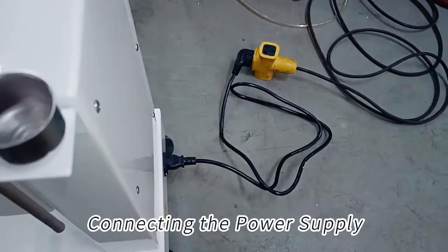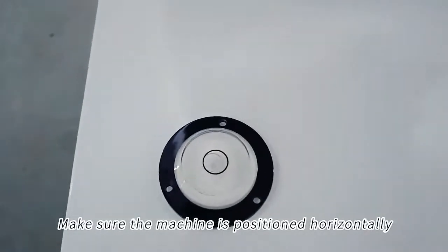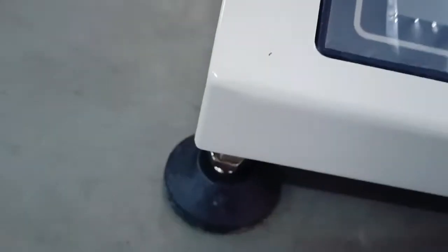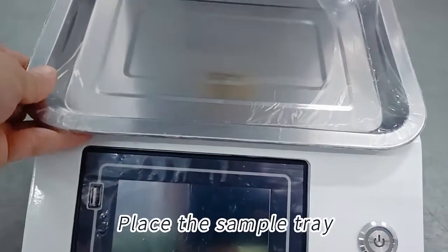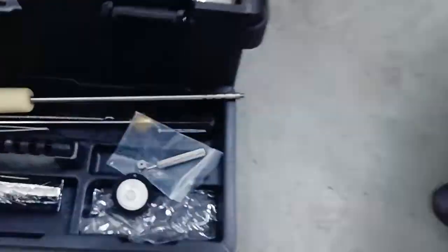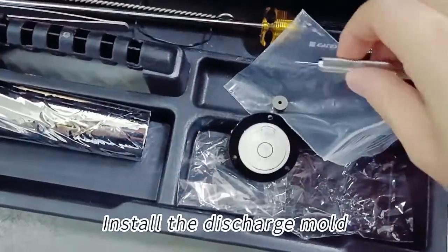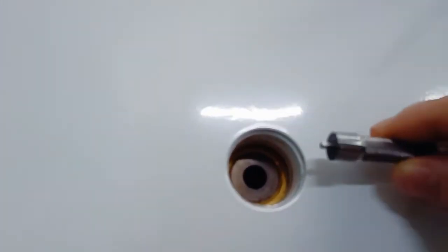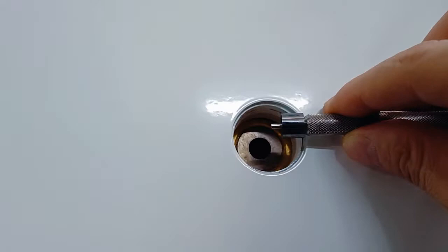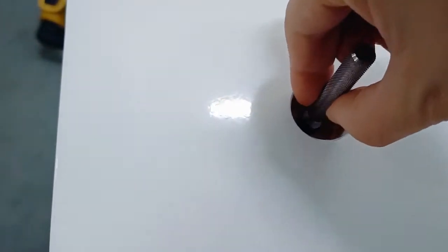Connecting the power supply. Make sure the machine is positioned horizontally. Place the sample tray. Install the discharge mold. Turn on the machine.